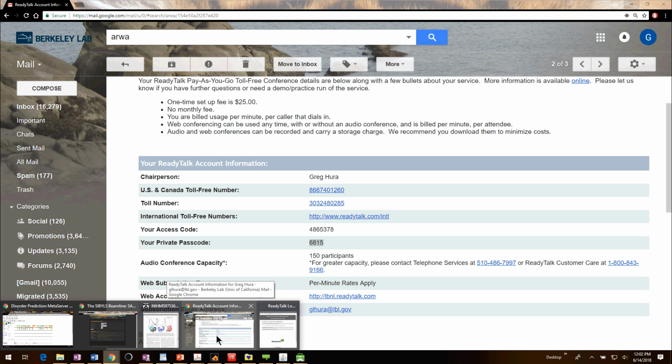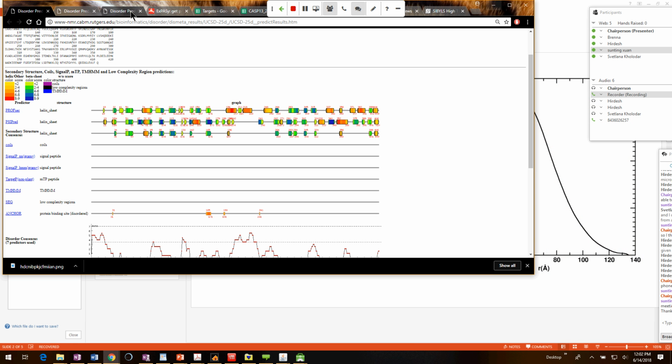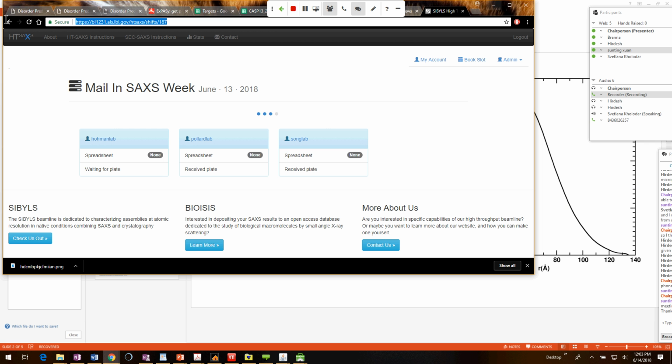Any questions? In my case, I think I have monomer-dimer equilibrium in my samples. So do I have to go with size exclusion, SAXS, and to nail everything down? It depends on what you have in hand. If you have structures of your monomer already, or potential dimer. I have traces. Okay, that's very good. I was trying to do modeling of different fractions of monomer and dimer.